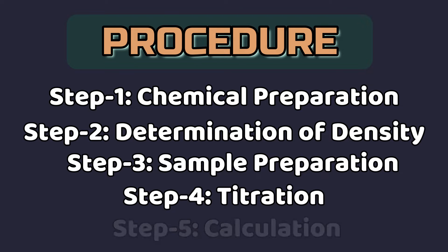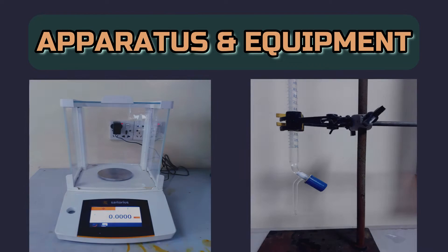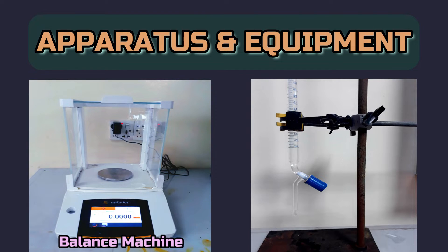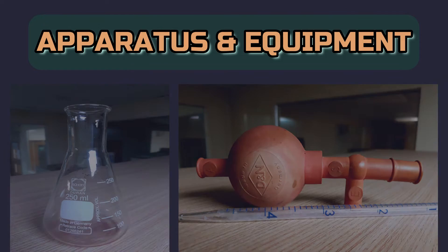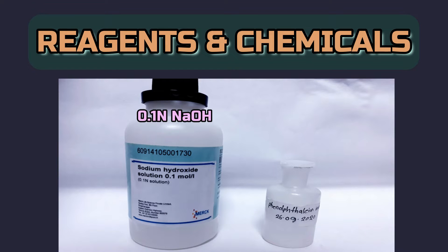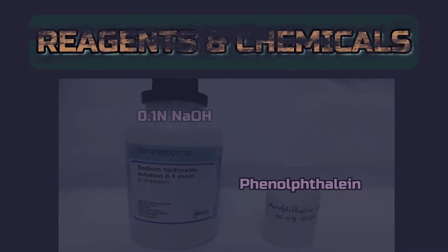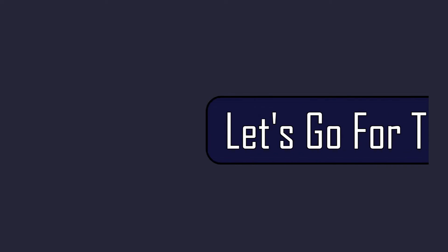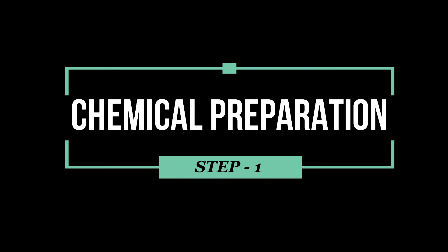We need some apparatus and chemicals such as balance machine, burette, stand, conical flask, pipette with filler, 0.1 normal sodium hydroxide solution, and phenolphthalein indicator solution. Let's start the analysis.